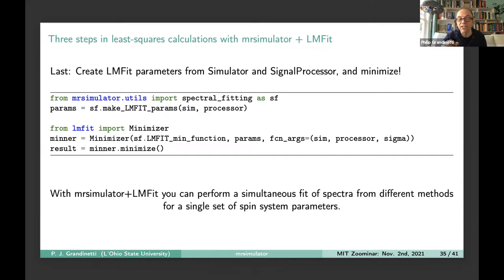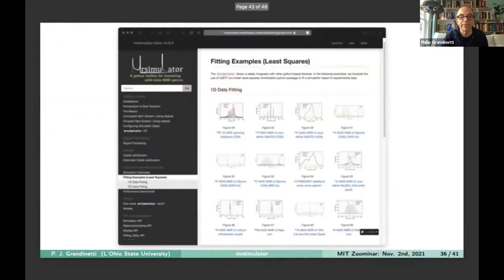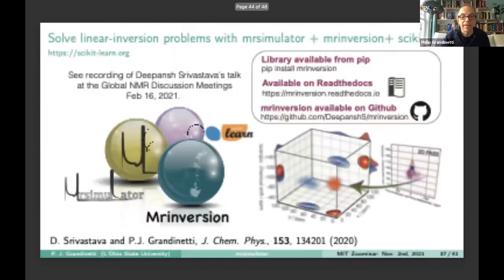And what's cool about this is that you can fit simultaneous spectra with different methods for a single set of spin system parameters, because LMFit has all of these nice capabilities built into it. And so we also have on the website examples of fitting different types of spectra. So if you have a case that's there, you can just follow along. If you don't have the case there, write a script, send it to us. Maybe we'll add it to the example list.